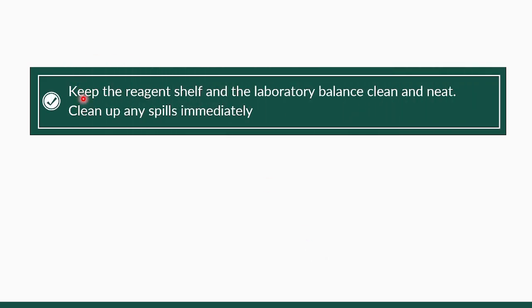Now, we also need to keep the reagent in a shelf and the laboratory balance in a clean and neat environment. So, ang mga reagents, dapat naa sila sa proper storage container, proper storage room, para dili sila ma-expose sa mga contaminants, no?